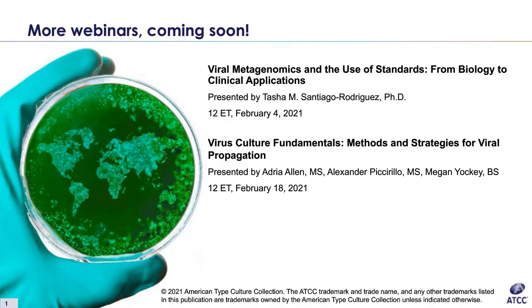So this next question kind of goes back to what we were talking about, growing cells with antibiotics. Can you use a contaminated culture after treating with the antibiotics? Generally speaking, it's usually not recommended to use cells in flasks after they've been contaminated, just to remove that sort of problem from your incubator.